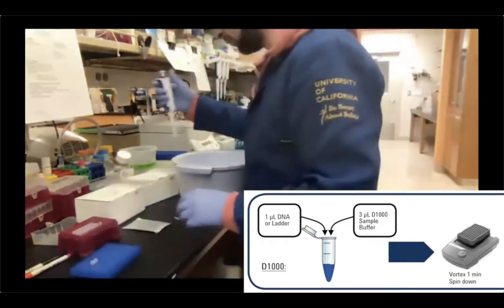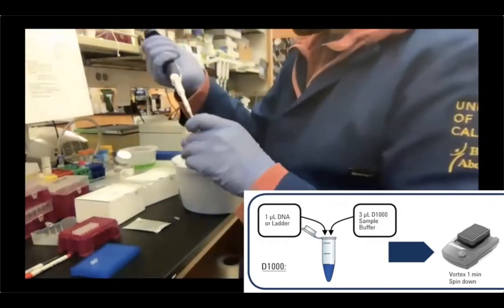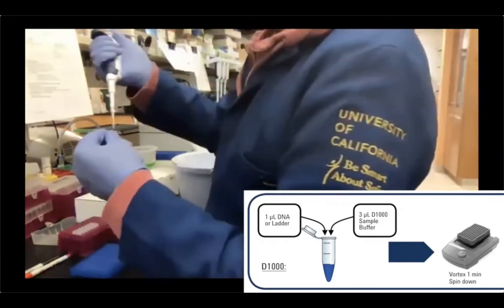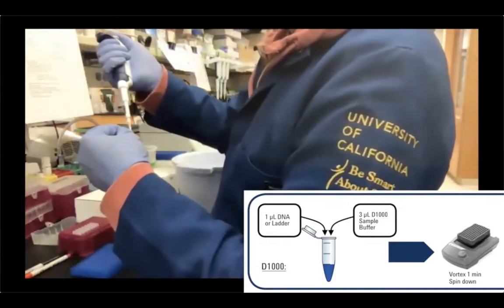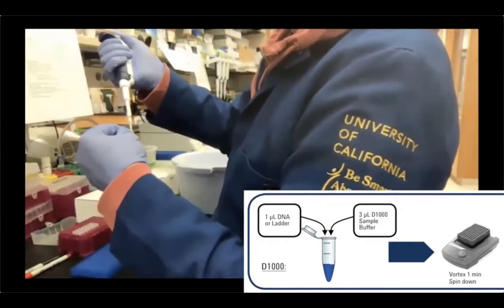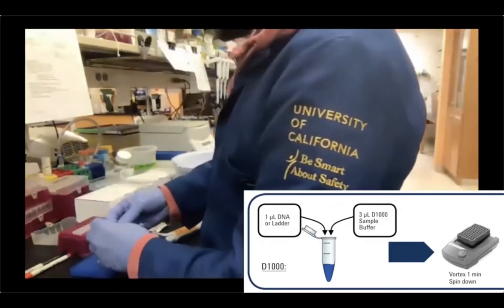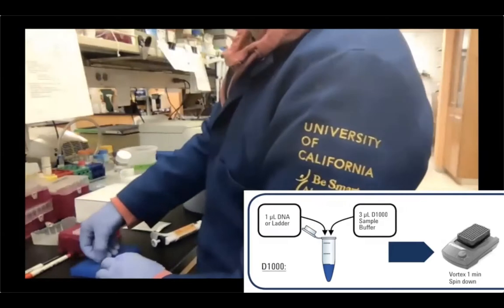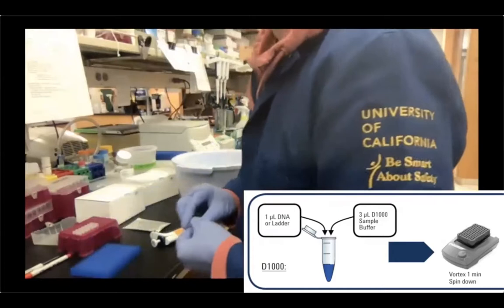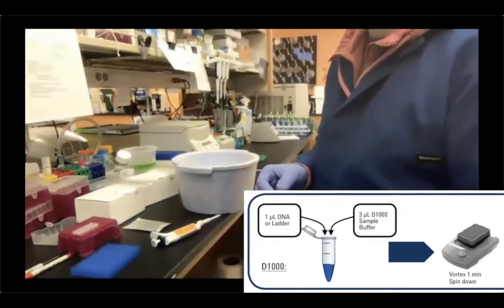And we discussed yesterday that if you have a contamination of adapter dimers of 1%, that's basically borderline to be sequenced. Otherwise, you're going to have a huge contamination in your final data. So if you want to be able to detect 1% of adapters, the lower limit of detection on the ethidium bromide gel is a band of 10 nanograms.